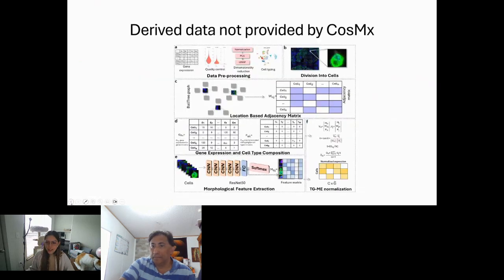Okay, so let's start working on our pipeline. We split this, as Dr. Flores mentioned, into 3 scripts, but we're going to go step by step together so we understand how to do this. First we split the pipeline in half: the pre-processing, and then after the pre-processing, we start with the artificial intelligence model.